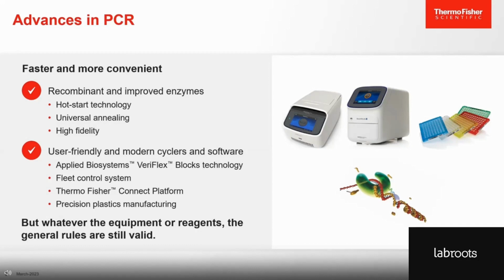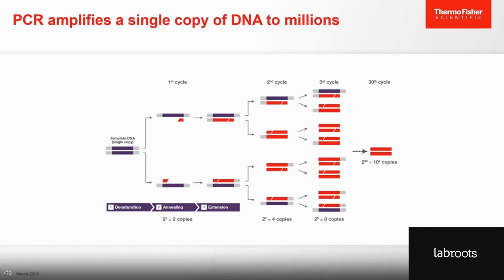In this webinar, we'll dive deeper into the world of PCR, exploring different types of DNA polymerases and their unique properties. We'll also take a closer look at the latest advances in thermal cycler technology and how they have made PCR more precise and reliable than ever before. Whether you're an experienced researcher or just starting in the field, this webinar is for you. We'll cover the fundamentals of PCR and explore some exciting applications of this powerful technique. Let's begin with a brief background.